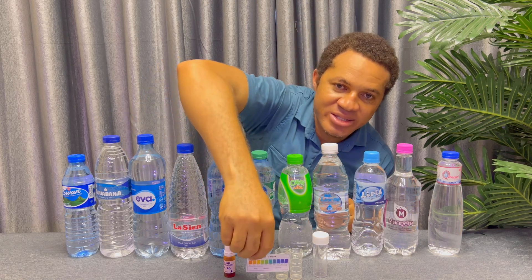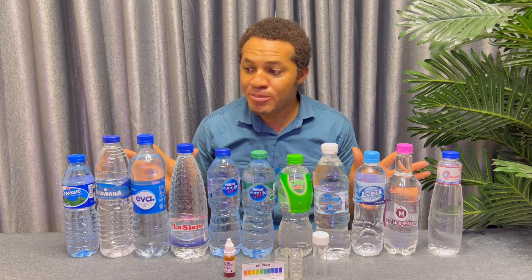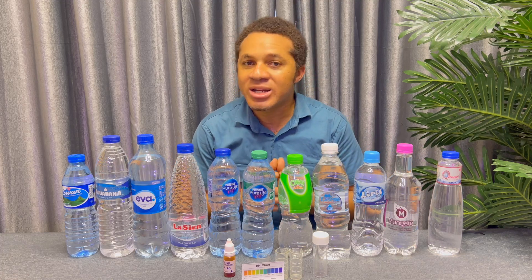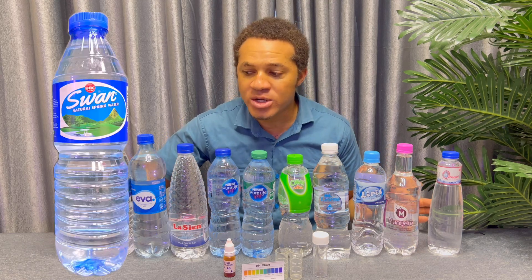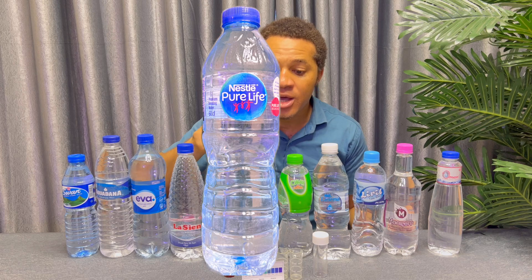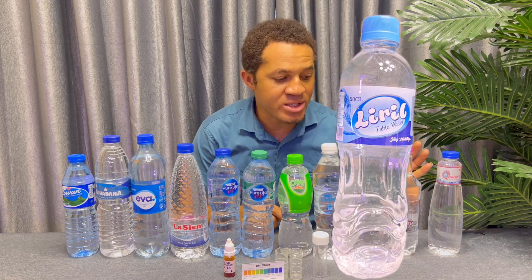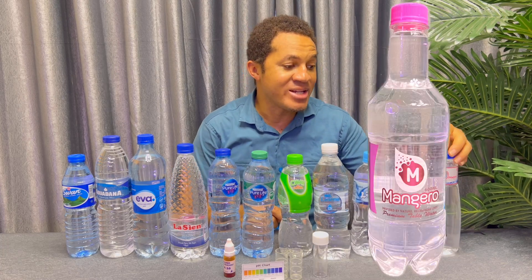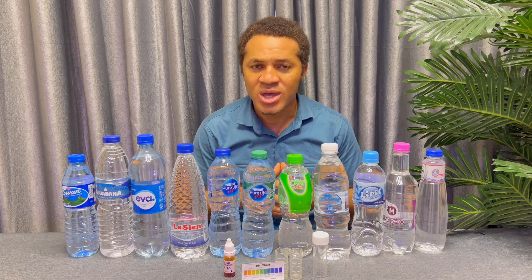This chart will show you if the water is perfect or not. We also have our test tube for this practical. Let me mention the waters we have here, because some of you may have some of these in your country: Swan water, Aquafina water, Eva water, Lacine water, Nestle water, Nestle with Zinc, Seaway water, Lacina water, Liri water, Mangero water, and Maritabu water. These are the waters we are going to test.